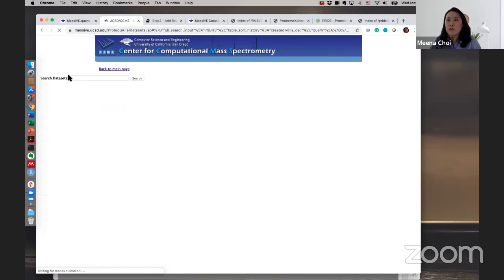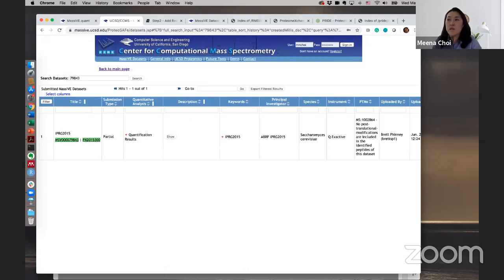I have a question: should the different containers have the same raw file? It can be, or it doesn't need to be. If I use the same raw file but set up the container differently, yes, definitely you can do this. The second case is if they have multiple experiment designs, you can set up the container with different raw files.